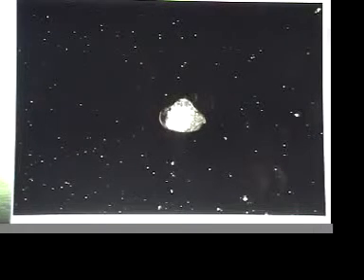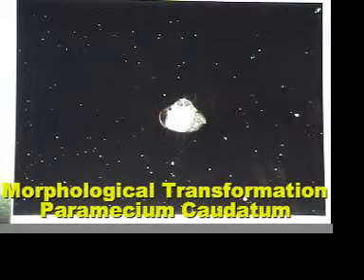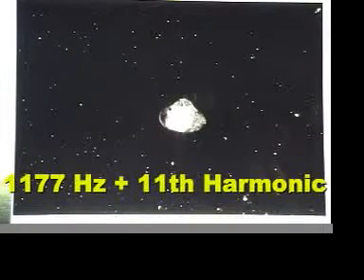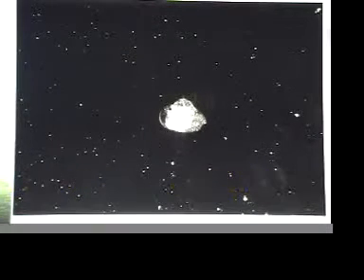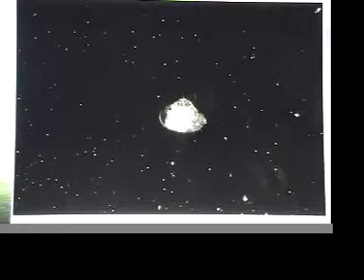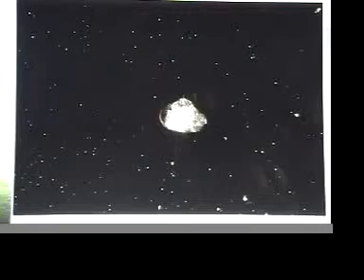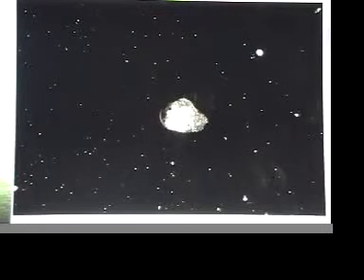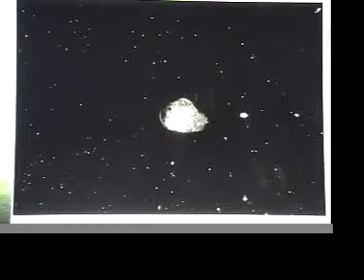This was a Paramecium caudatum. 1177 hertz seems to be having the best effect here. We can shift from dark field if we like. We've never filmed in dark field. You see this tiny organism swimming by on the right? It's fantastic. Perhaps an example of selective effect of specific frequency.